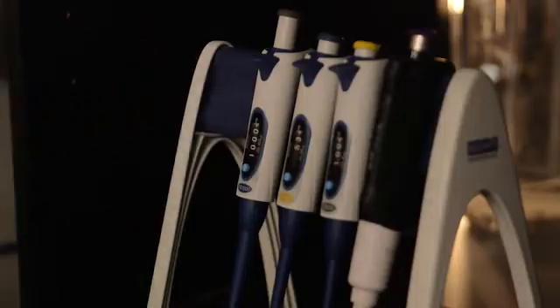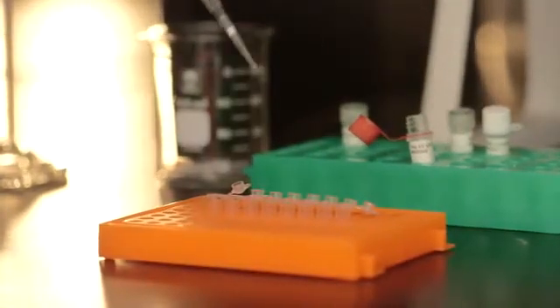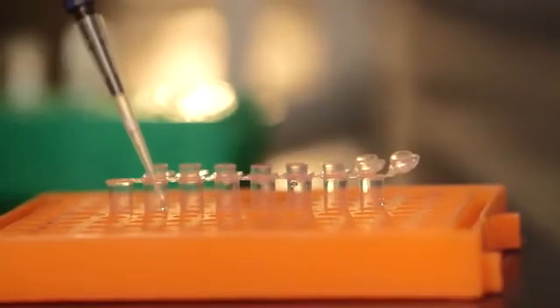People weren't thinking about it. They were thinking, okay, biotech is expensive, so if you want to build a biotech lab, people are going to have to pay hundreds of thousands of dollars per month, let alone the cost of reagents, the cost of keeping equipment up. Historically, the high price of real-time PCR is due to not only the cost of the hardware, but also the reagents needed to run it.